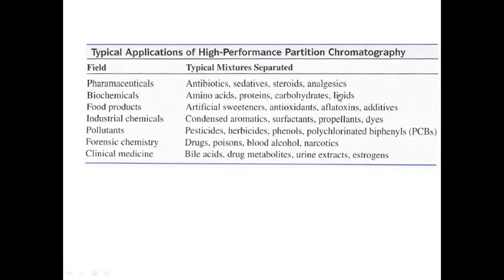And if you look at the applications of HPLC, no fields are excluded from analysis by HPLC. Pharmaceutical samples, biochemical samples, food samples, industrial chemicals, pollutants, forensic samples, and clinical samples can all be subjected. All varieties of samples can be subjected, particularly in the pharma industry.